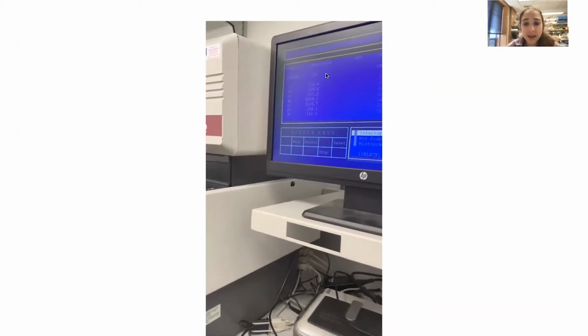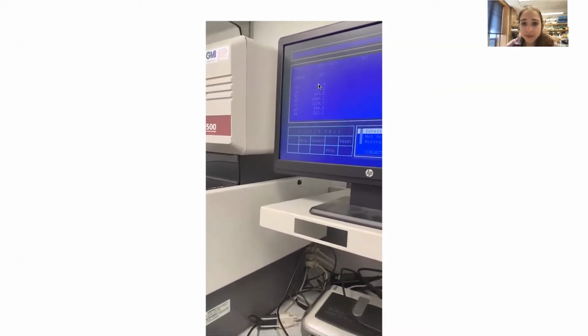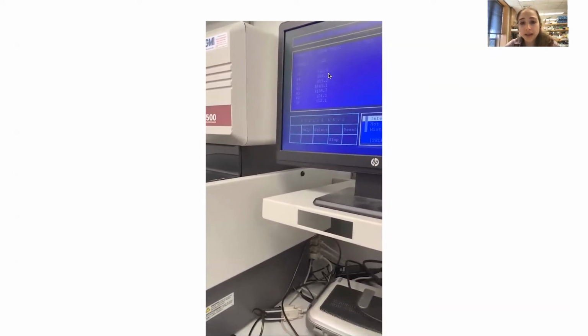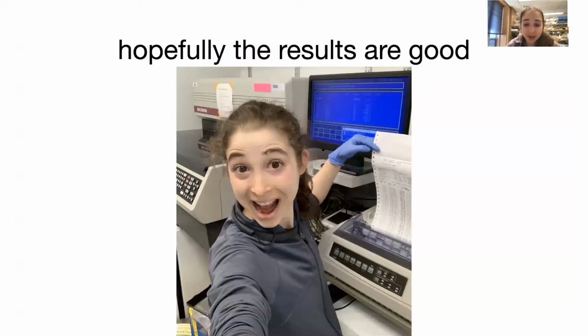It feels like ages. But you can see that the signal is kind of moving all around. And then it is going to finalize on the value, and give you a readout, print that and put it on the screen, and then move on to the next sample. Sometimes with really critical experiments, you're waiting so anxiously, watching the screen, because you have to check and wait for your negative controls and make sure everything's all good. But when it's all good, it's a very happy day.